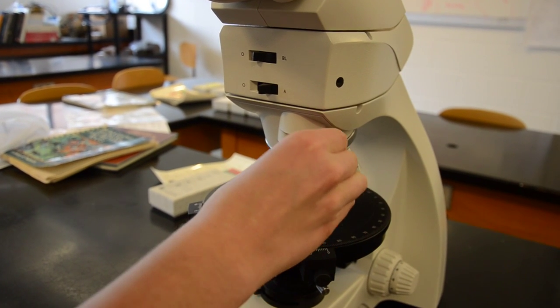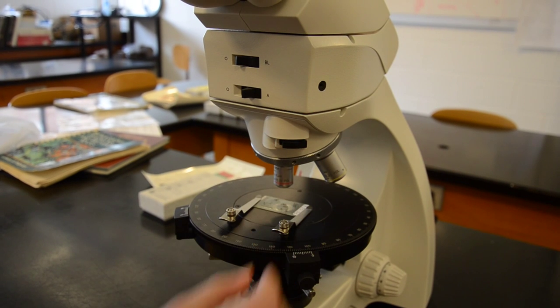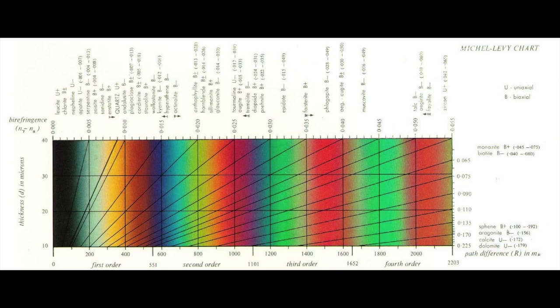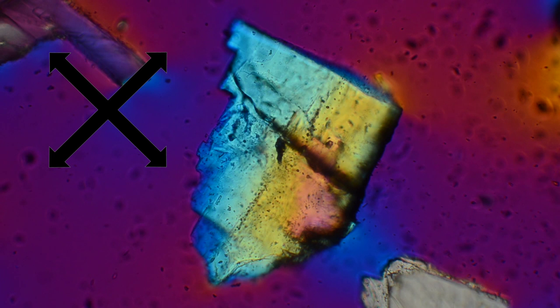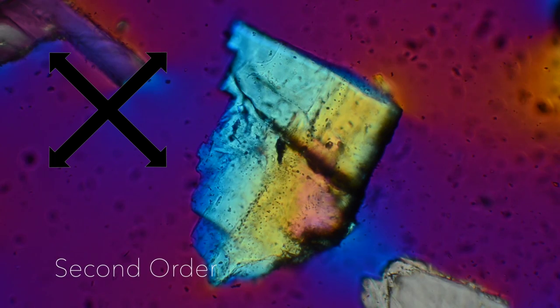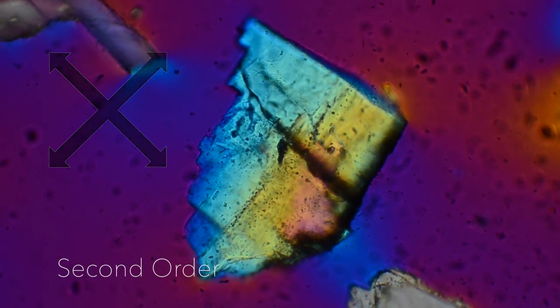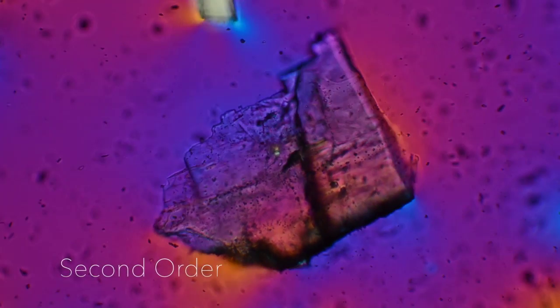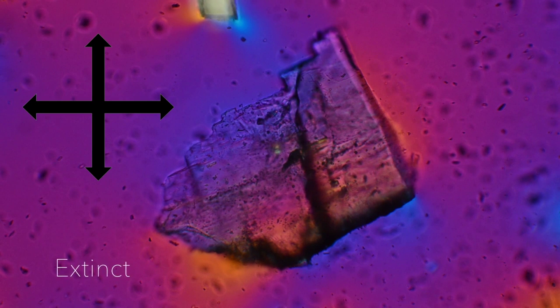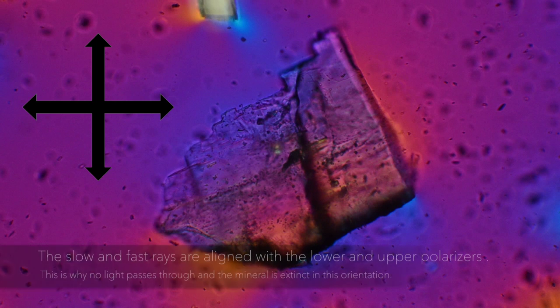Here I insert my accessory plate. Inserting the accessory plate will make the material appear magenta at the extinction positions because the plate's retardation displays a first-order magenta. This is the view of the same mineral with the accessory plate inserted. Here our mineral now displays second-order interference colors. Now I am going to rotate the stage 45 degrees to observe what this mineral looks like in an extinction position with the accessory plate inserted. You will notice that it is magenta instead of black.